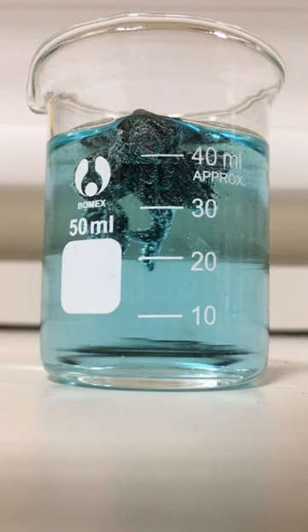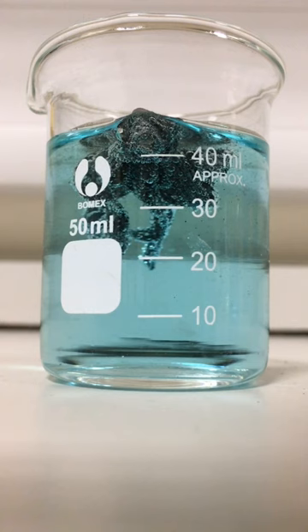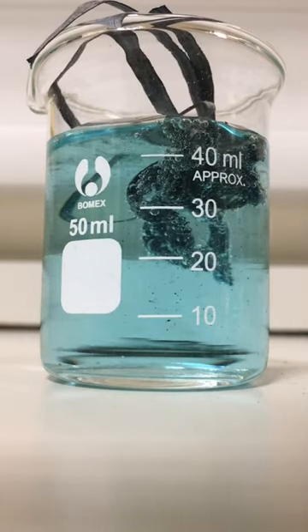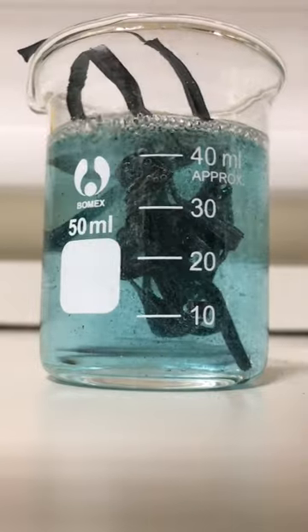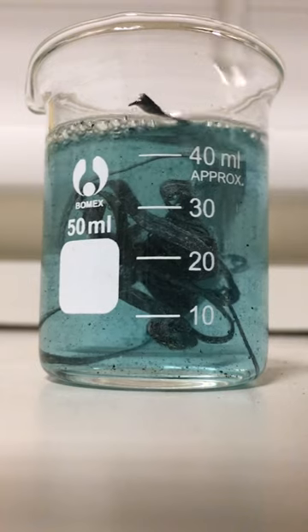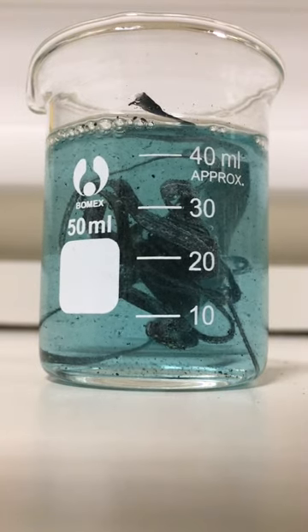The magnesium is going to end up as the ion, so Mg is going to go to Mg2+ plus 2 electrons. Do those 2 electrons just hang about and do nothing? No, they don't. They're picked up by the copper ions. More health and safety at work. The copper ions pick up those 2 electrons, and we should get some copper precipitated as I talk through this video.